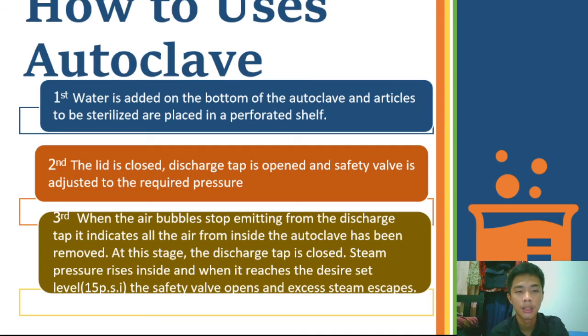When the air bubbles stop emitting from the discharge tap, it indicates all the air from inside the autoclave has been removed.